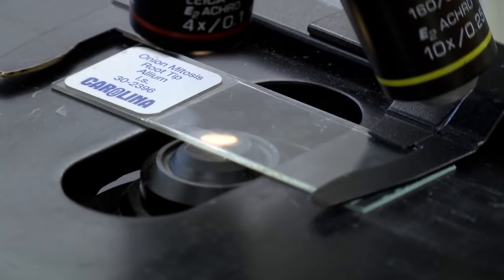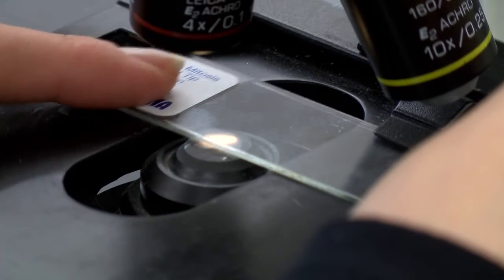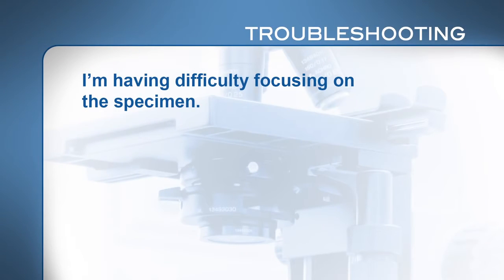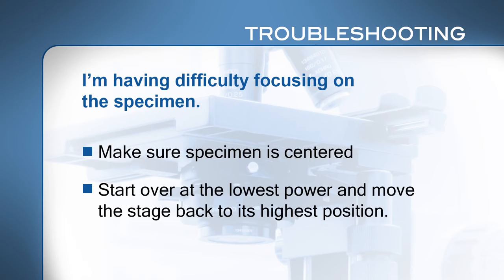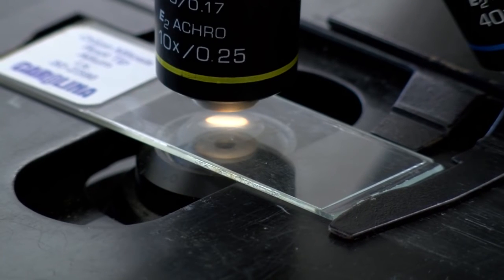If your slide doesn't move when you turn the knobs to adjust the slide holder, make sure you are using the right knobs and that the slide is clipped in place properly. If you are having trouble finding the specimen, make sure your specimen is centered. Start over at the lowest power and move the stage back to its highest position. If you get frustrated trying to focus, you can easily get so far out of focus that it's easier to start over. You should only need to do minor adjustments at each magnification. When focusing, move the slide just a little bit back and forth with the slide holder knobs — your eyes can see motion better than stationary objects.